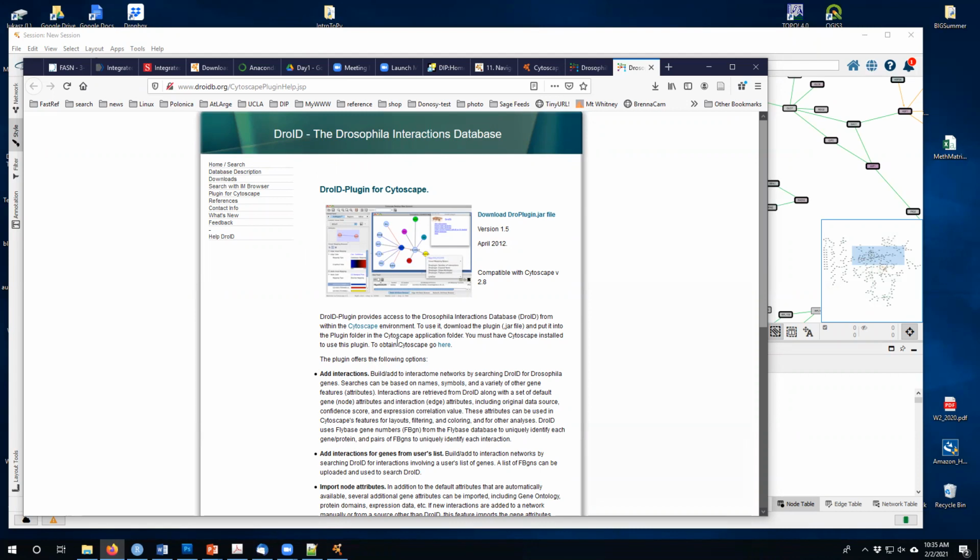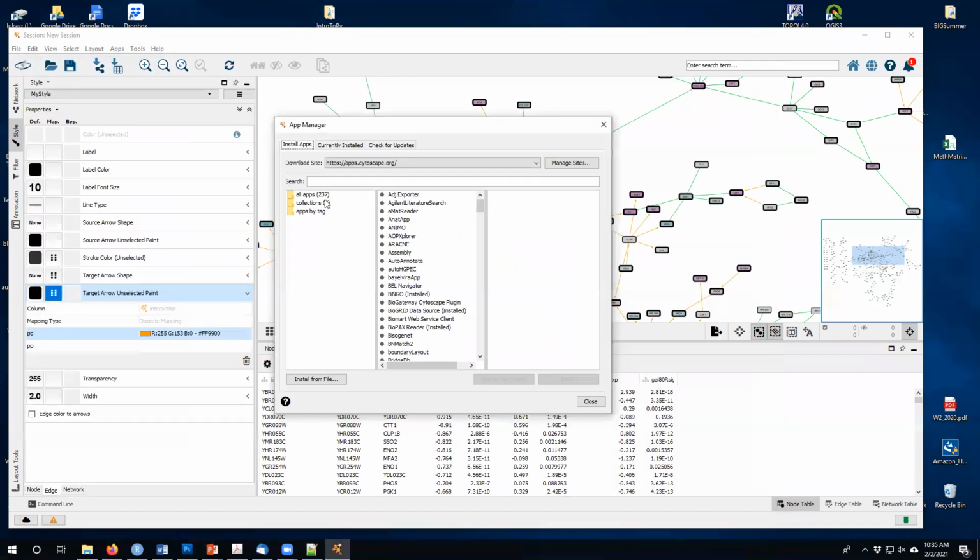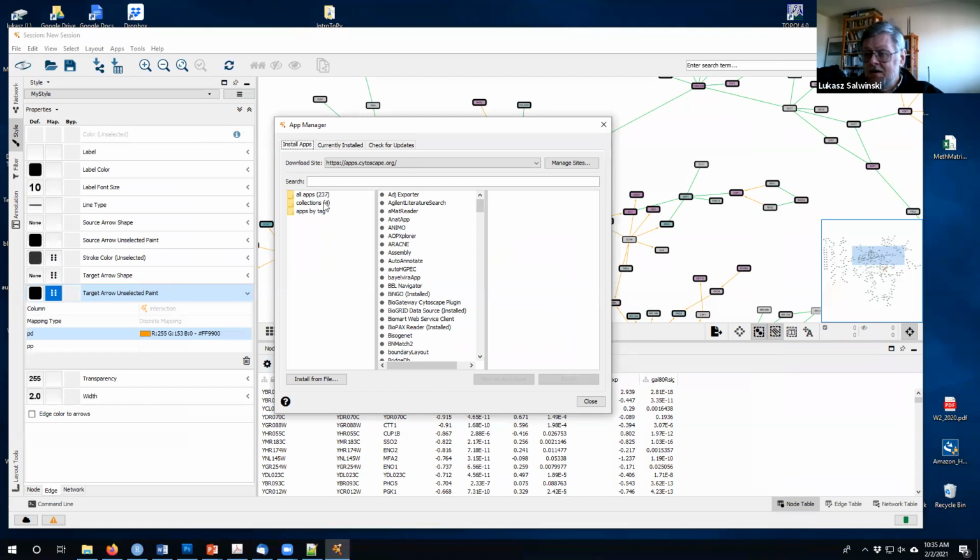I appreciate it. But it's good you mentioned this, because this is a very common problem. You've got about 250 or so apps.